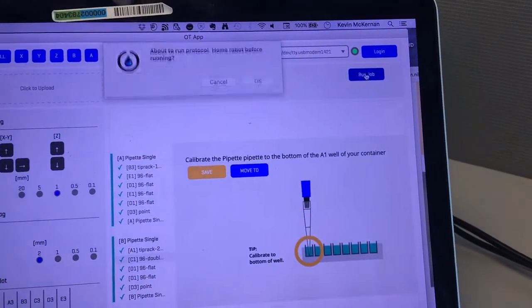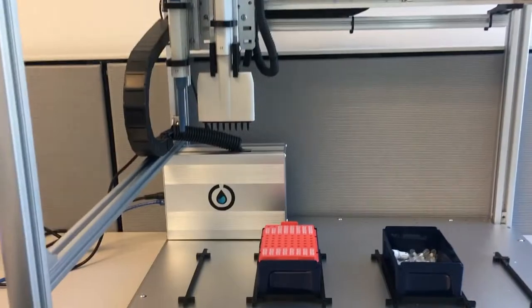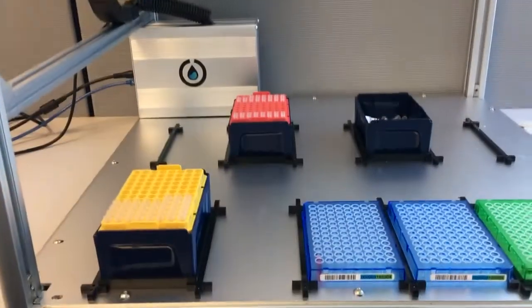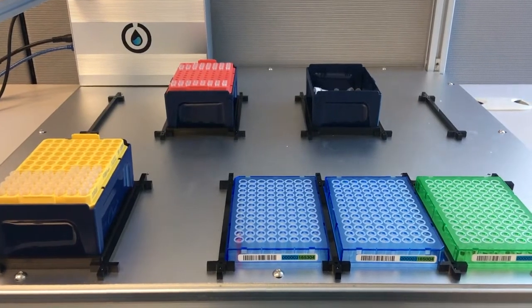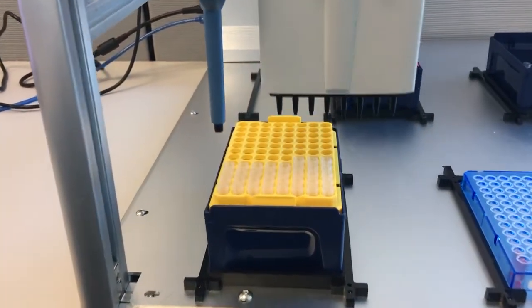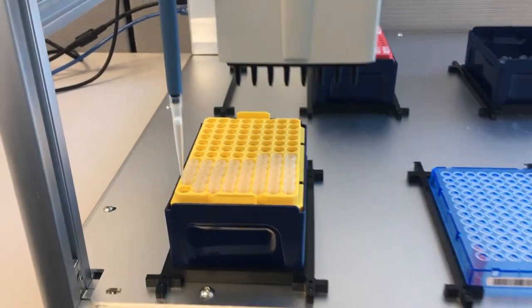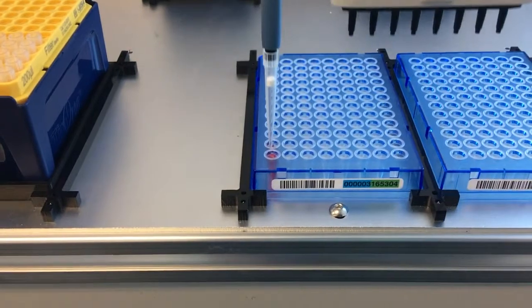A very simple interface here allows these things to take off. And there you go, homing a robot. This process will run about 2 minutes and 45 seconds to do 16 samples. That's about 330 samples per hour — plenty fast enough for a lot of folks' needs for screening seedlings or clones.